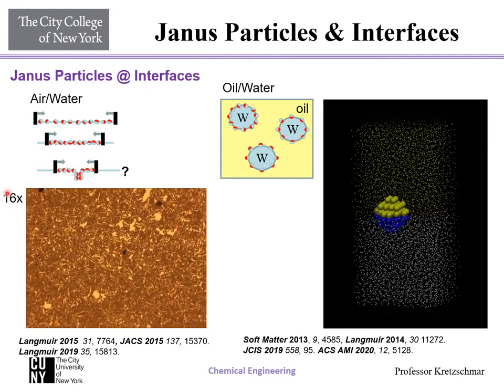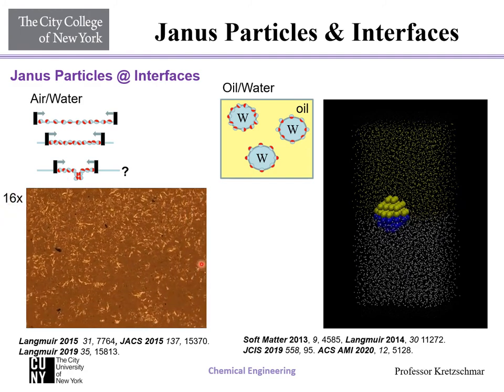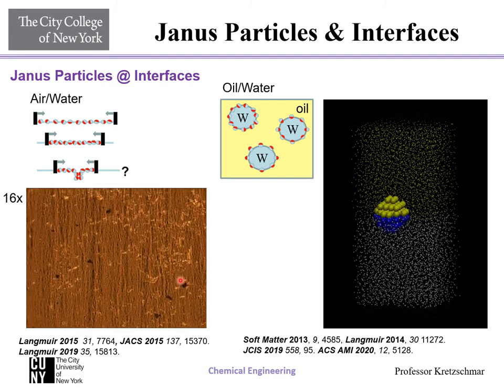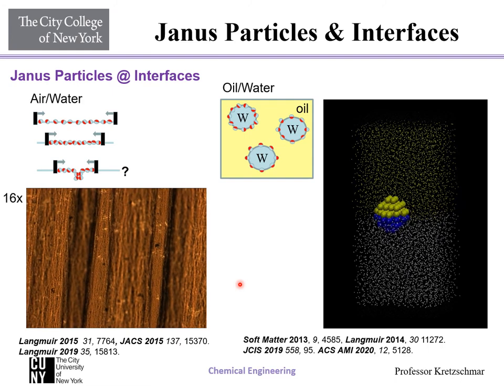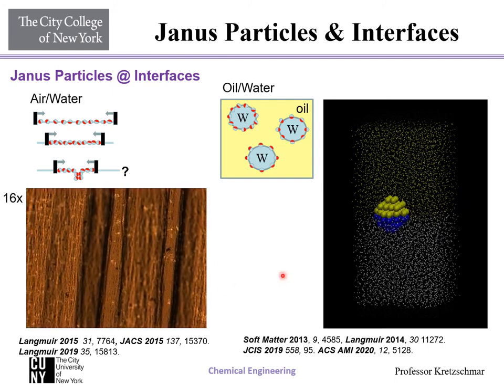Note that this video is sped up 16 times, and you will see that very soon you will start to see the wrinkling of the surface, and then you will start to see folding, and you see very deep folds. And so as these folds are formed, the particles stay in the interface, but the interface gets actually deformed.